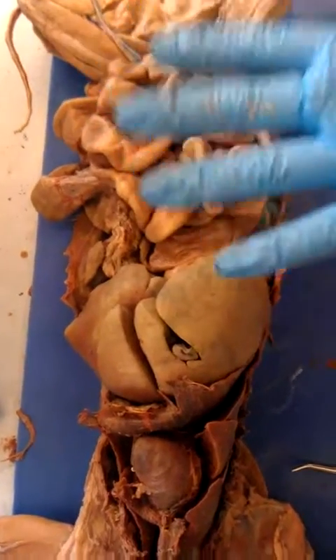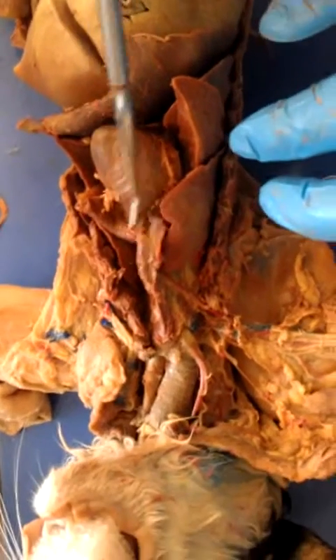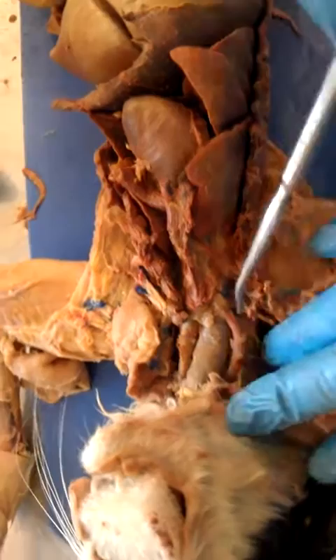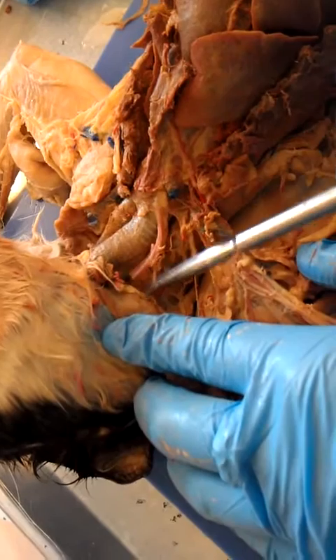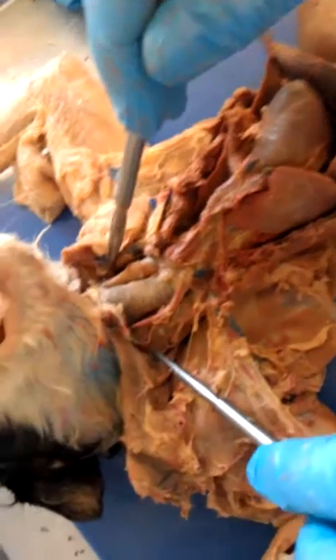The testes are not on this cat because this is a female cat because it has ovaries. That's kind of the big thing, but they would be right here on a male cat. There would just be a bulge right there. The thymus gland is partially present here, but because it's an older cat, it's kind of going away. The thyroid gland, we believe it is right here. This guy right here. Expose it a little bit better. It's this right here. You can see that. And there's two of them, one on each side.